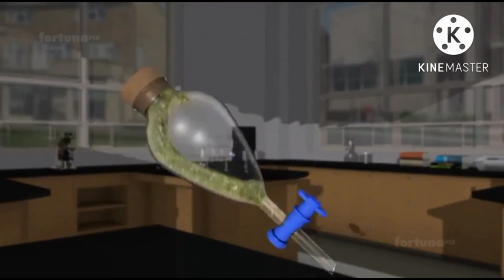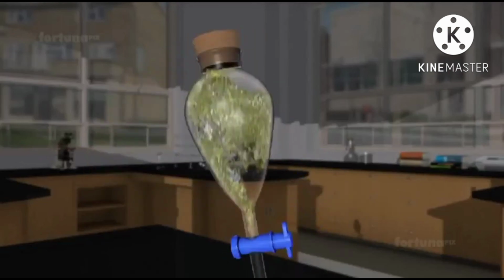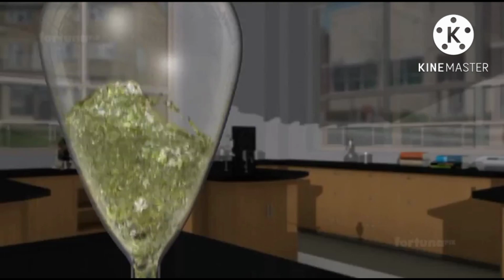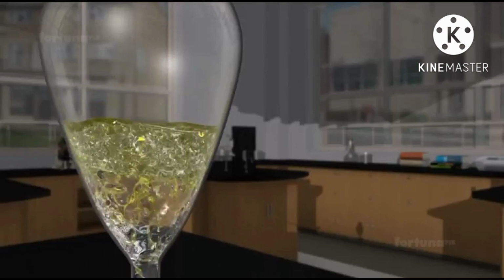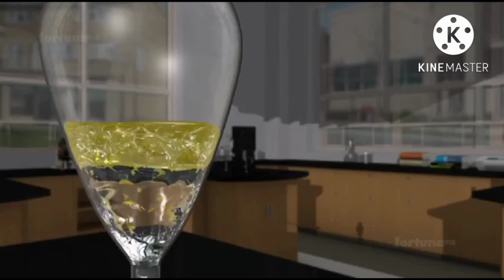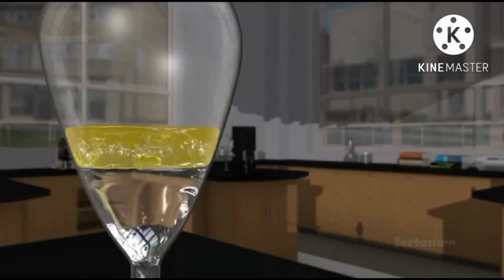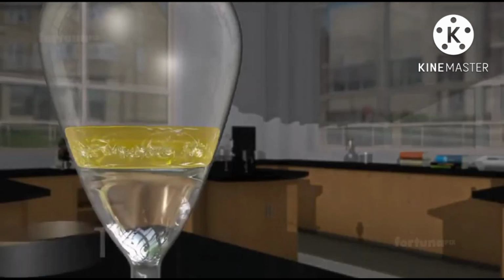Shake the funnel gently and set it aside for several minutes. You'll see the two liquids beginning to pull apart. Water, because of its higher density, will travel down into the conical part of the funnel. Oil, which is less dense, will float on the surface of the water.